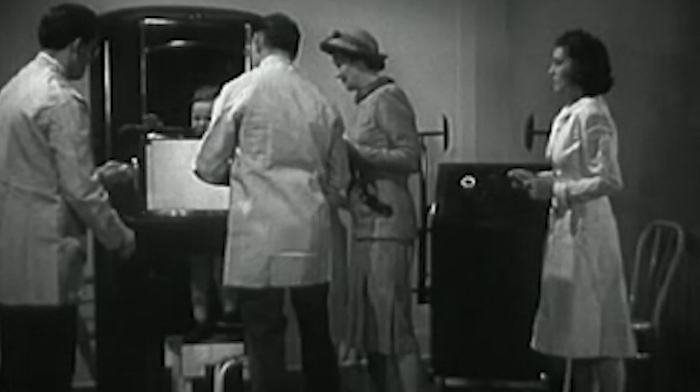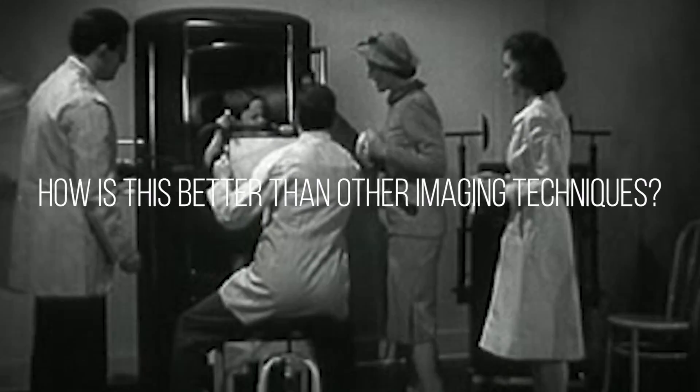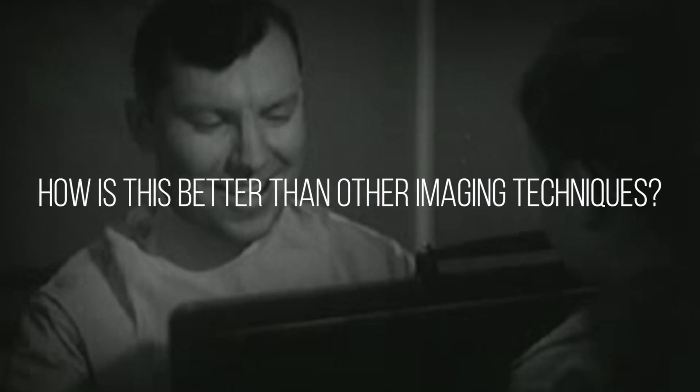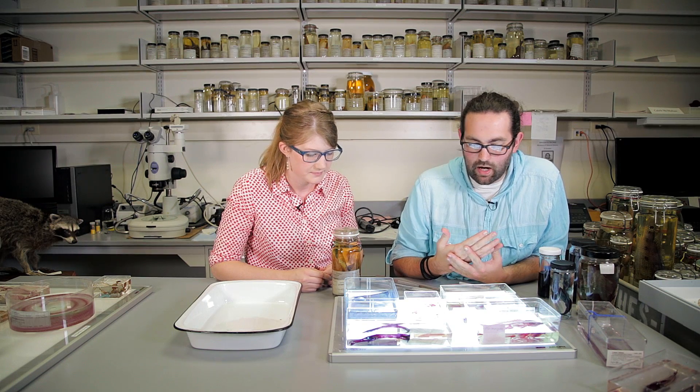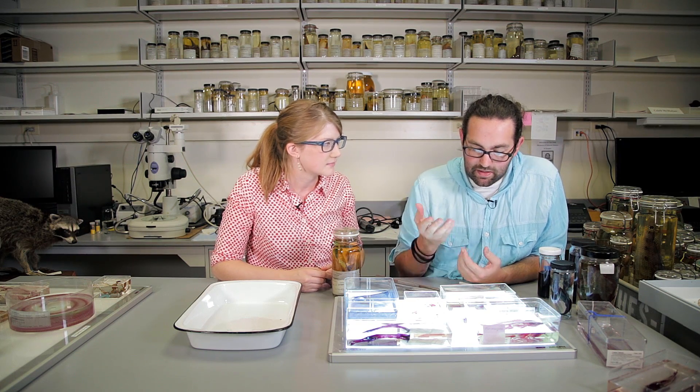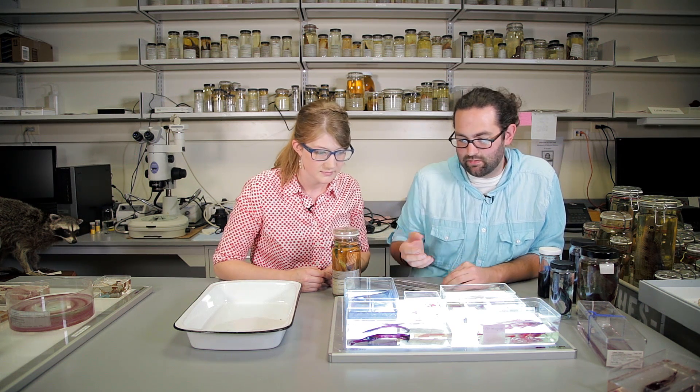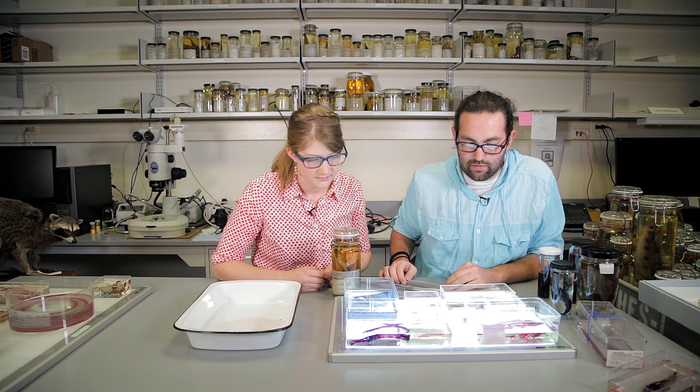Why would you use this process over something like an X-ray or a CT scan? It seems like it would be a little more involved than that. We still use X-rays a lot — radiographs for looking at skeletons. But the nice thing about cleared and stained specimens is that we get a 3D visualization of the skeleton, which X-rays don't give us.